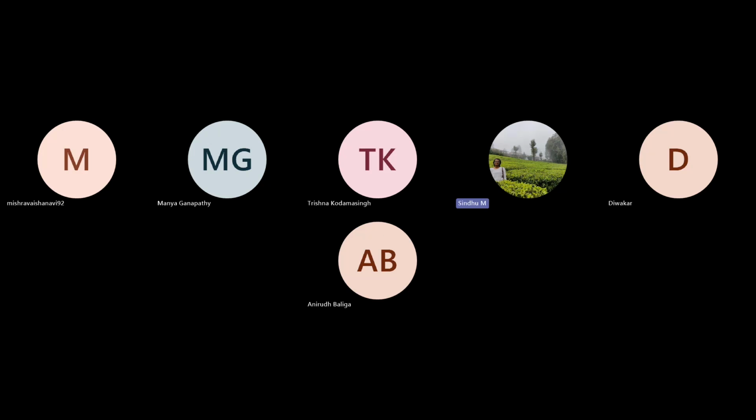And I'm just roughly giving this value. Yeah, and then in these time lapse or any kind of stack, time stack or Z stack, typically the brightness settings that you set will be propagated to all the images.